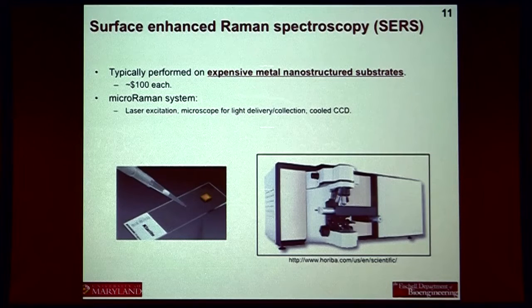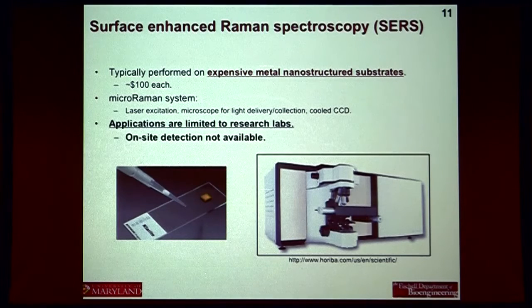And this is, well, this is Gary Rubeloff's spectrometer. So I'll mention that. This is kind of a common Raman spectrometer configuration of what we've seen over the last 15 years, where you've got a microscope that's about a $100,000 microscope hooked up to another system that's anywhere from $100,000 to $300,000 or so. So in most of the papers that get published, this is what SERS looks like, this particular combination. Well, this really puts us into a research lab still, not even a central lab, because nobody's going to want to know whether that apple is contaminated for $100. So this just doesn't really make sense.